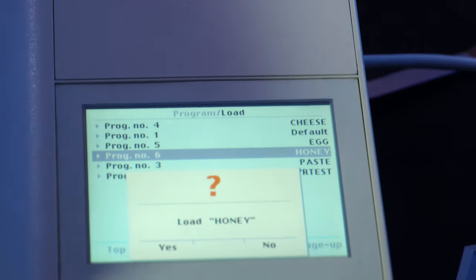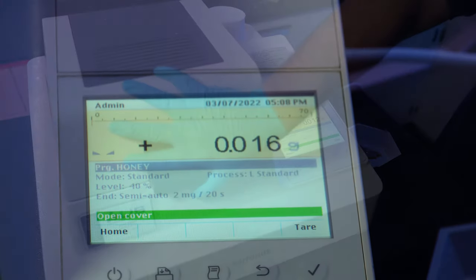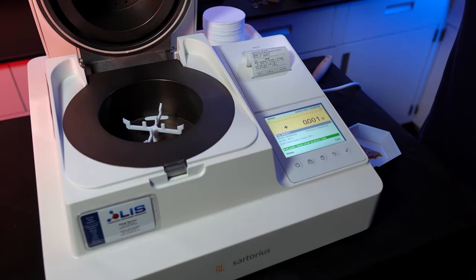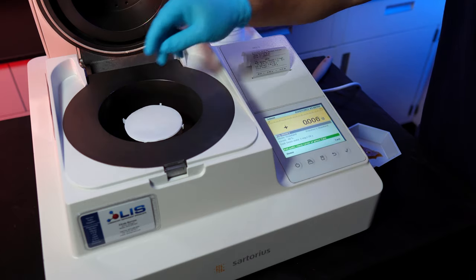Now we'll do a second test, this time on organic honey. We'll follow the exact same steps as we did with the cream cheese, except this time we will load a pre-configured program for honey.